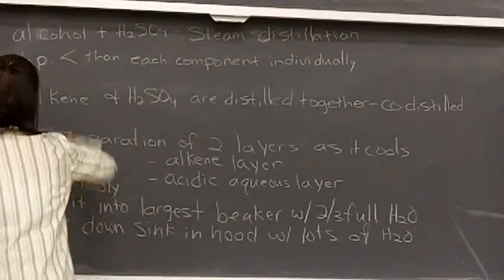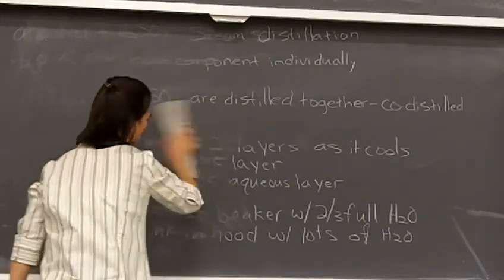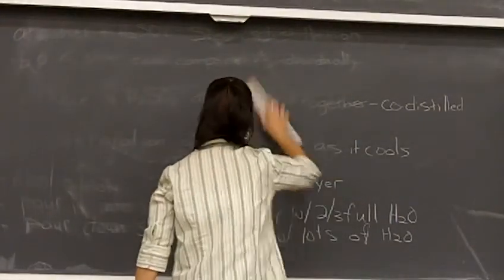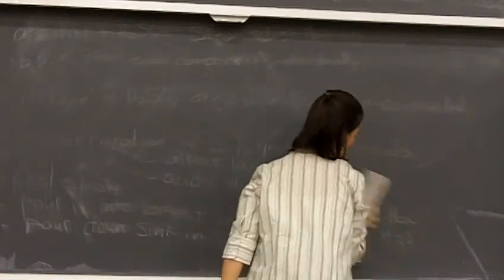we've talked about separations with boiling point and using fractional distillation. Our alkenes have such a close boiling point to one another that we couldn't use a fractional distillation to separate out each individual alkene. So that's why we have to use GC.